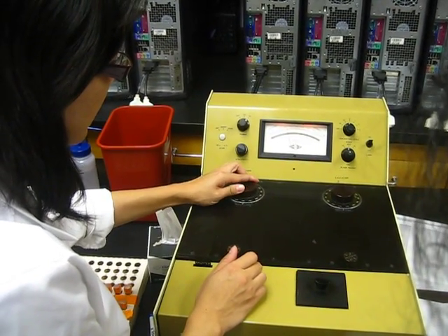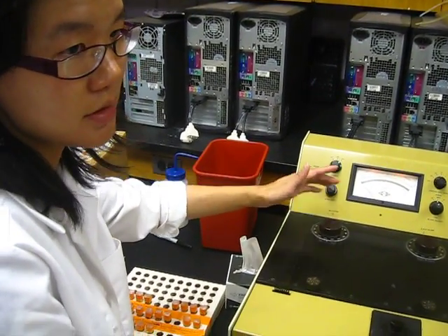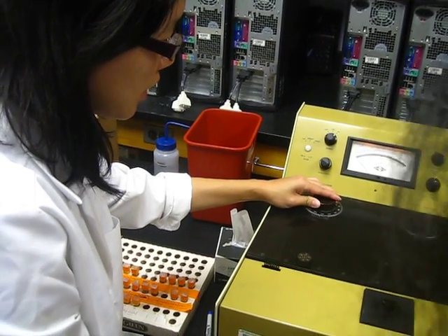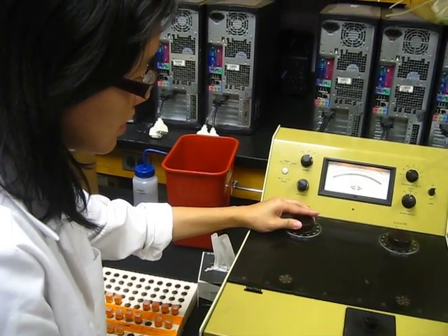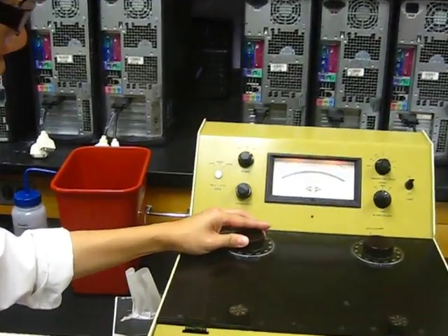Okay. Choose 3, and because we already know that the emission wavelength is longer than the excitation wavelength, we just change it from 440 to higher until we get the maximum. Okay, it seems here we get the maximum.